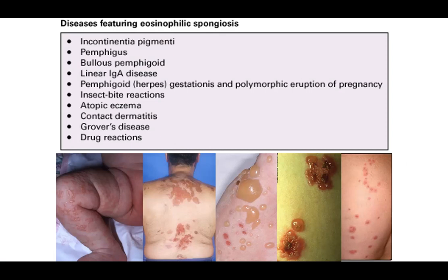actually cause anything in dermatology. So any inflammatory pattern can be associated with some type of drug causing that reaction. Usually if you see multiple inflammatory patterns, like a lot of spongiosis, a lot of interface change, a lot of perivascular eosinophils, you can think about a drug reaction for sure. It's truly hard to rule out drug reactions. You really have to have a high clinical degree of suspicion.